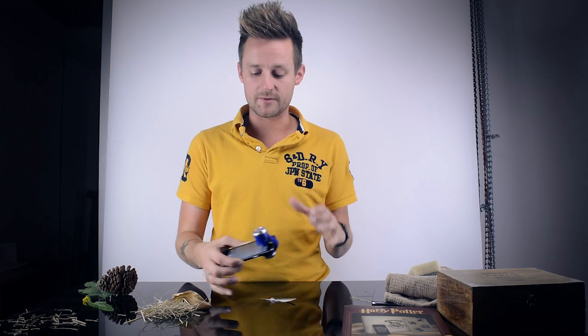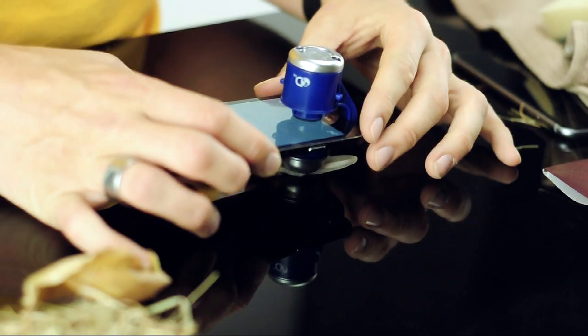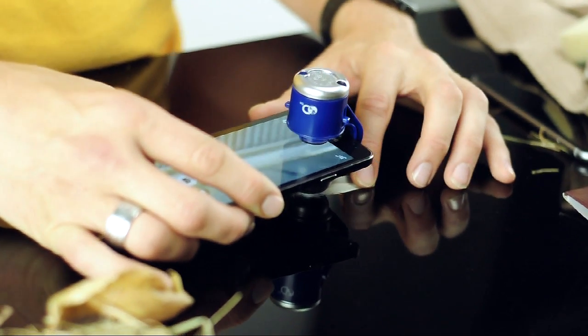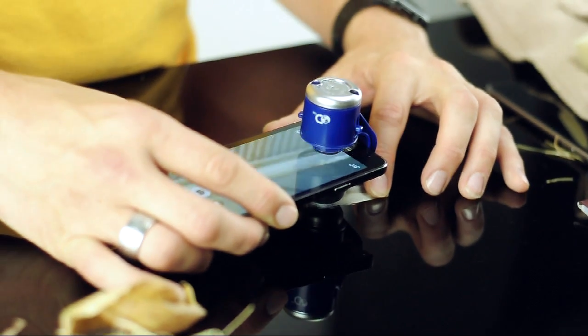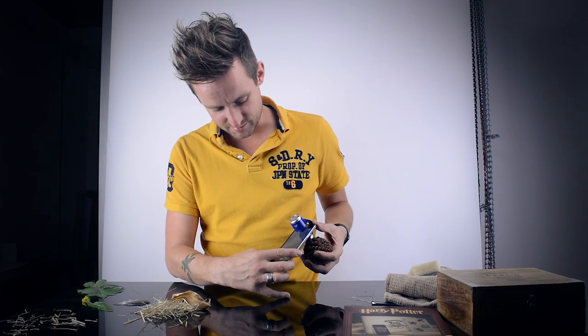I've grabbed a few bits from outside — have a look at this. The great thing about this microscope is that there's no focus on it. You don't need to zoom in or out, because all your smartphones these days have that function themselves. So you just put it in place and it will find the perfect focus, find that sharpest image for you. As you move it, you can see the camera trying to adjust its focus. Oh look at that — that's glorious. We could literally play with this for hours.